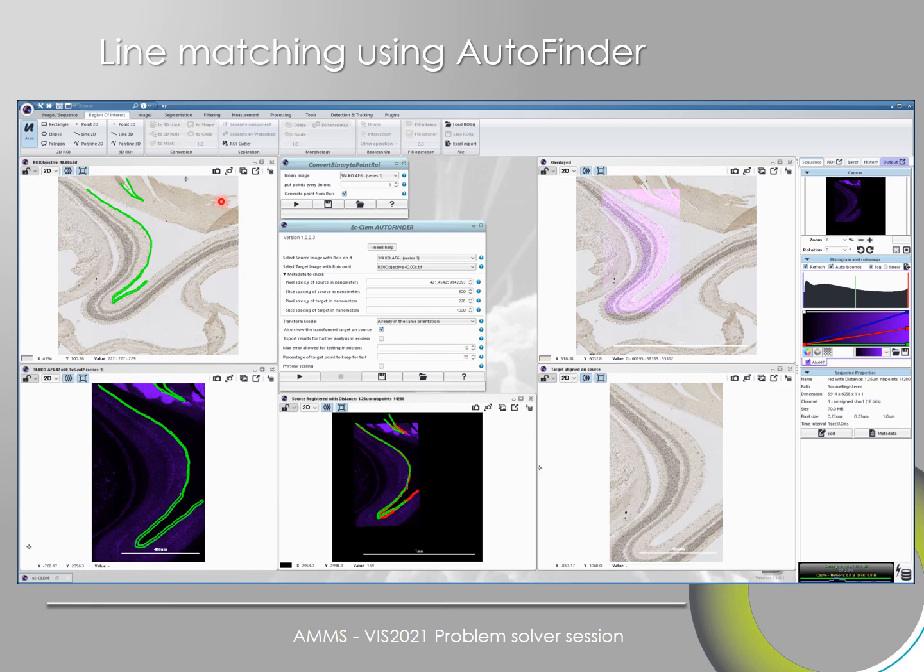So there is an option, and I will come back to how to deal with that in detail, where you draw the outline of your structures in both data sets. Then you convert this outline of structures into a series of points by converting the binary to point ROIs. And then you use the eC-CLEM AutoFinder software. You feed it the information about the pixel size and the transformation, and all of this is detailed in the book chapter. I'll come back to that point.